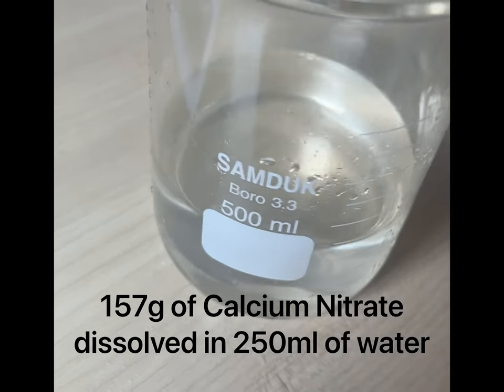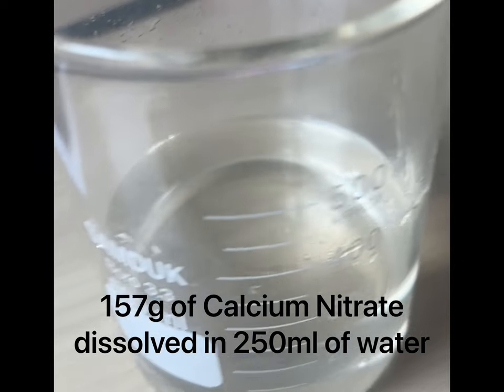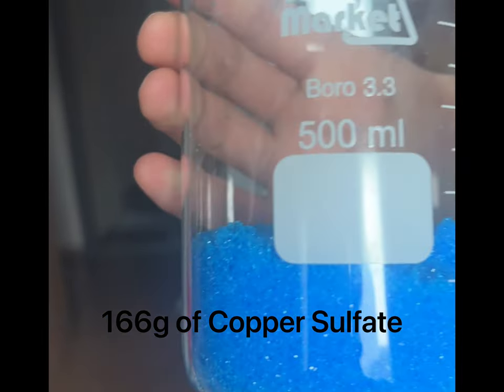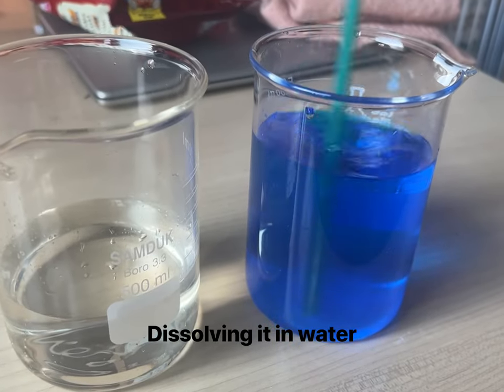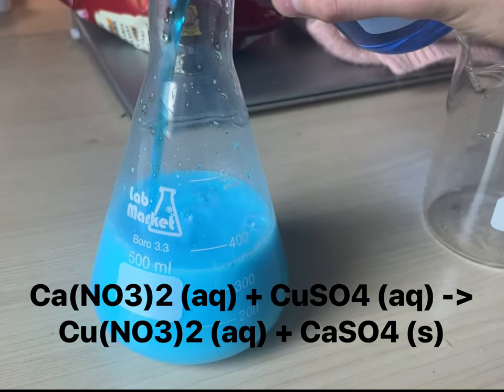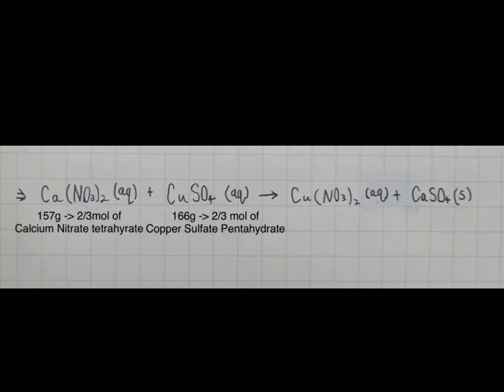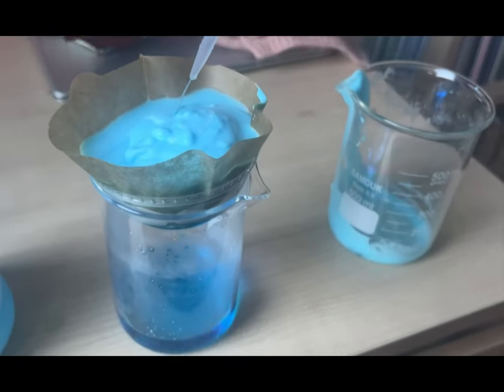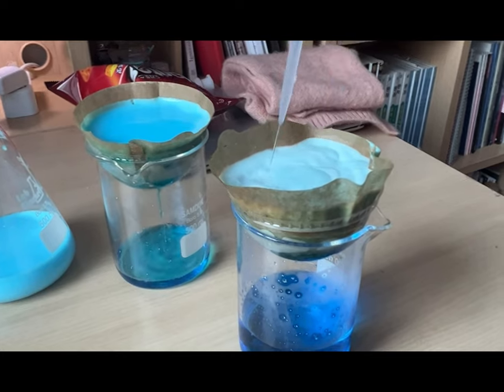First, I dissolved 157 grams of calcium nitrate tetrahydrate in water. Then I got 166 grams of copper sulfate pentahydrate and also dissolved it in water. Afterwards, I mixed the two solutions together and waited for the reaction to finish. The two salts will go through a double displacement reaction to make copper nitrate, which will stay in solution, and calcium sulfate as a precipitate since it's nearly insoluble in water. I spent a decent amount of time filtering out the calcium sulfate.